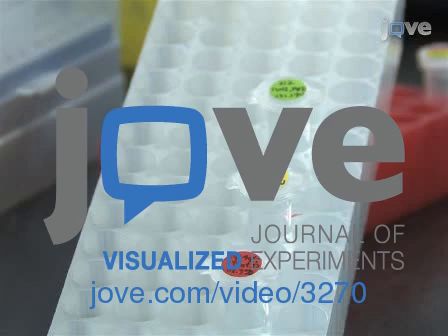The DNA constructs are collected using an ethanol precipitation protocol. The injection mixture is made to the concentrations listed in the table.